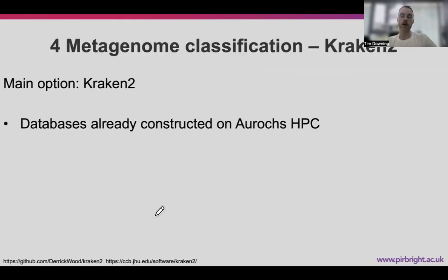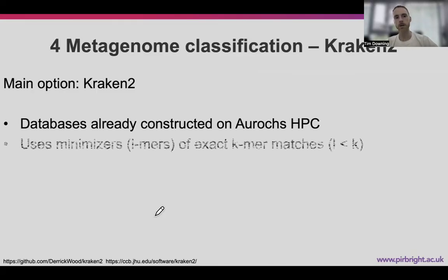We're going to focus on Kraken 2, and advantageously we have the databases already locally on ORACs, which makes it easier than trying to create these databases on your own. It's not always straightforward, and you need considerable space as well. And Kraken 2 is also a high RAM tool, so you need sufficient RAM to make it run effectively.